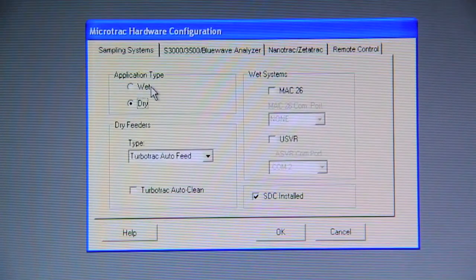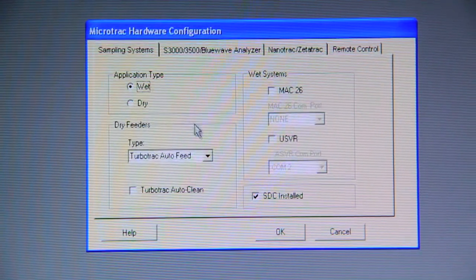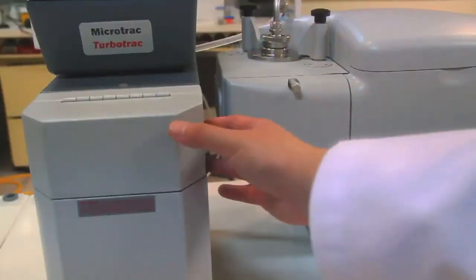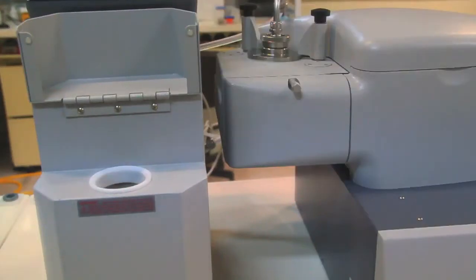To analyze a liquid suspension, select wet application on the FLEX software for the system to automatically communicate with the SDC. The SDC is filled with the background solvent.